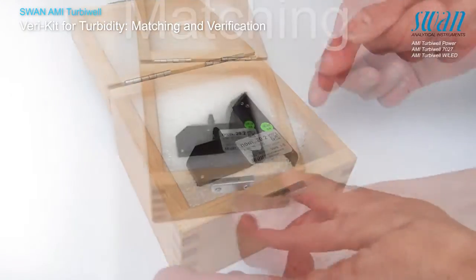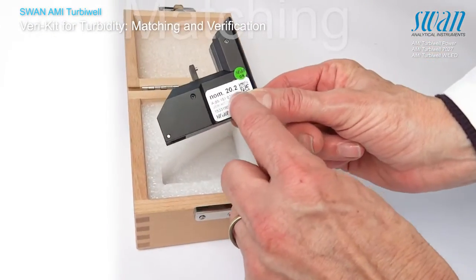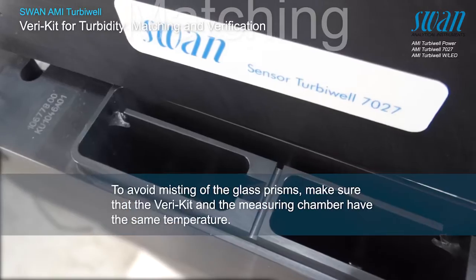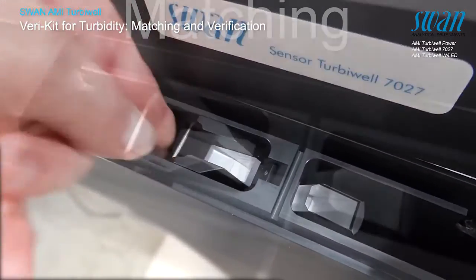Carefully take the varikit out of the box. Avoid touching the optical surfaces when working with the verification kit. Insert the varikit and ensure that it is fastened correctly.